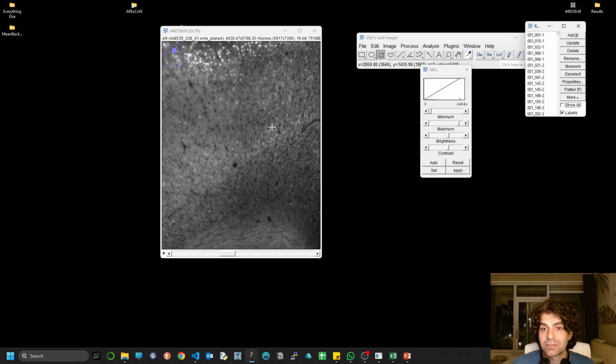Again, a lot of credit to the people who made Cellpose mostly, and of course all these people who are contributing to advanced 3D, because the only thing that I'm really doing is just bridging a gap between cell detection and some further processing and analysis here.